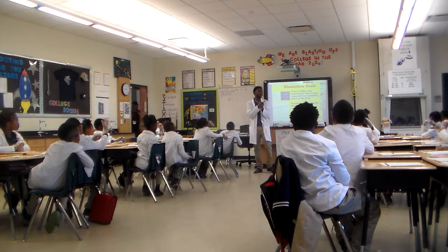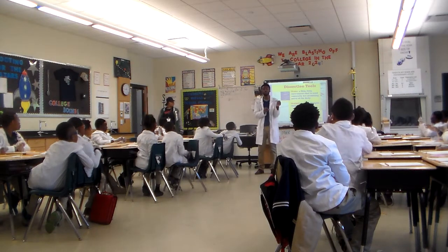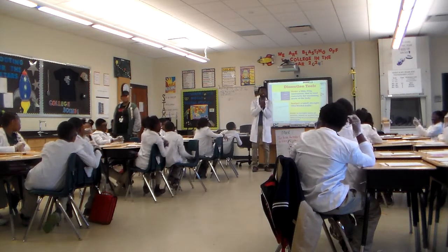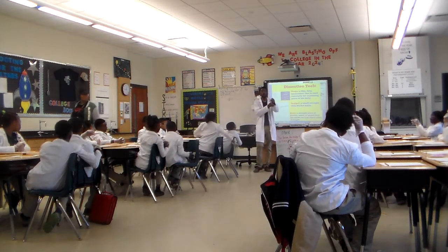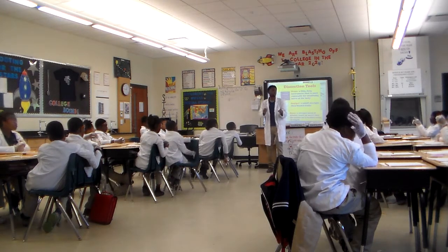When you guys need the scalpel, I'm going to come around and help assist you guys in cutting open your specimen, right? So when you need the scalpel, simply raise your hand and I'll come around, right? And I'll help guide your hand to cut open whatever part of the specimen you need, right?